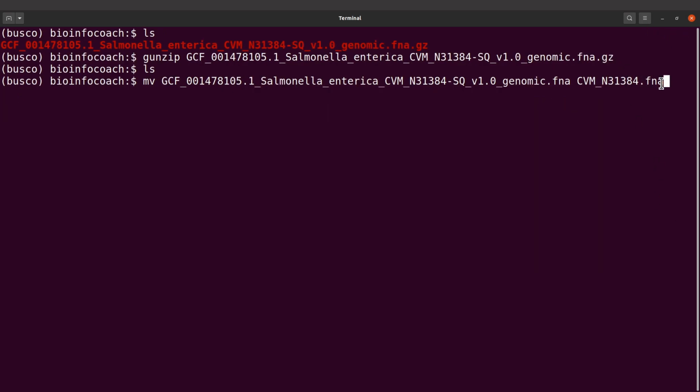Okay, so this is it. This is the new name. Again, I repeat, you can change the extension and make it .fasta is also fine, but I'll keep it as it is. So I'll rename now. Perfect, that has been done. So let's do an ls, and we are going to find a file there.